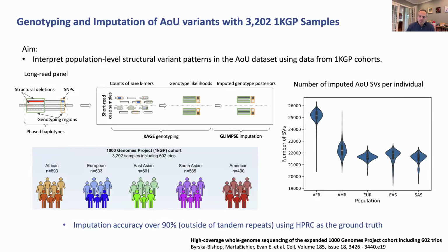So we can discover variants in all of us, and then we can visit, in this example, 1,000 genomes data, so that we can comment, even though these variants are from people of African American descent, we can notice that many of the variants are common in admixed American populations and European populations, East Asian populations, and South Asian populations as well. So it's really a nice resource globally, even though we started with individuals of African American descent. And then also this pipeline will be very valuable later, so we can tap into additional data sets.